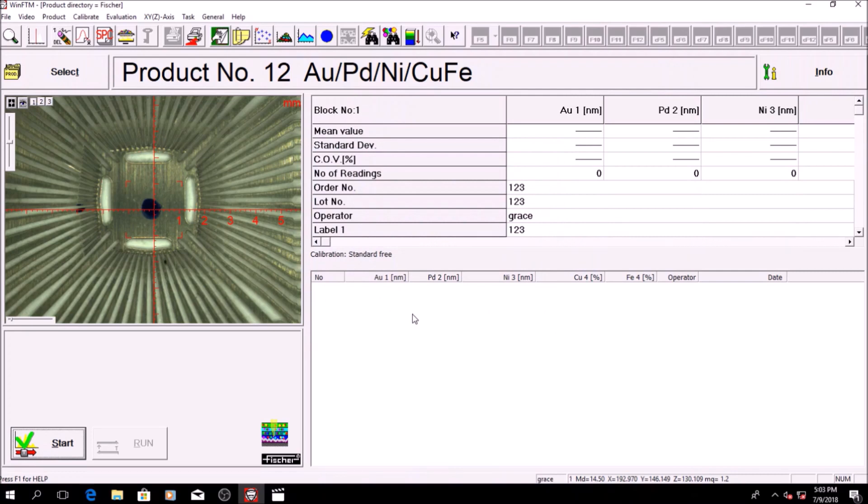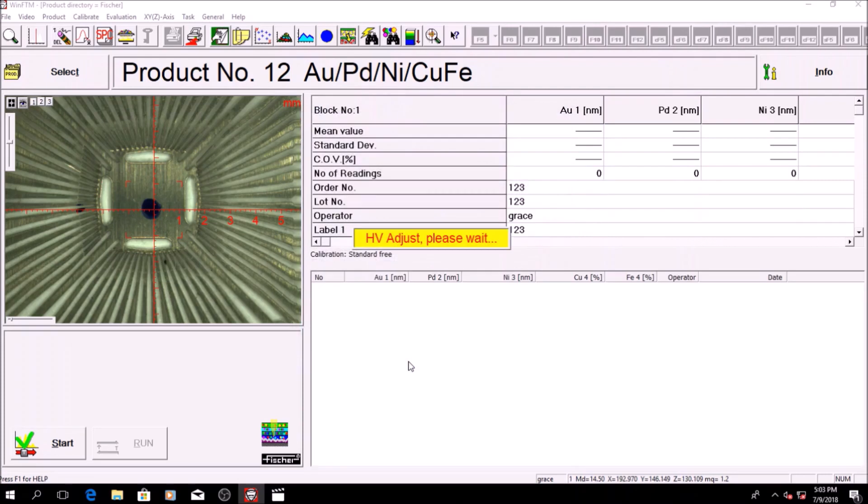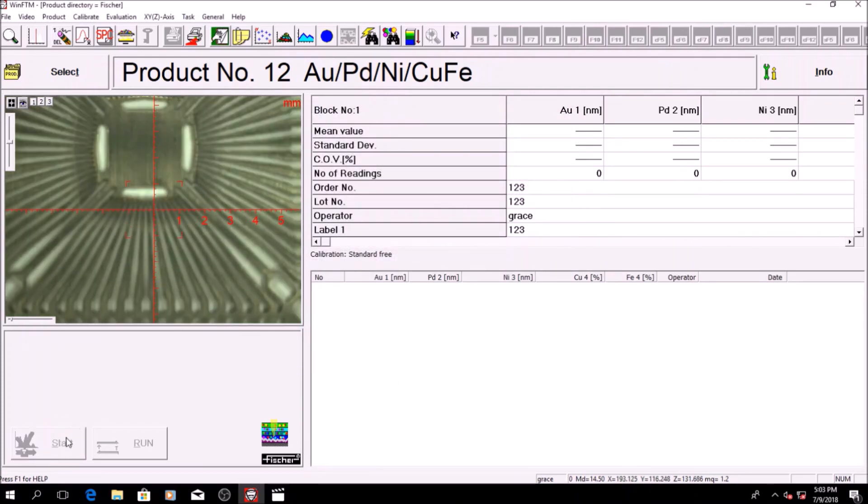Click on info to adjust the measuring time, number of measurements, and unit of measure. Afterwards, click start to start measuring.